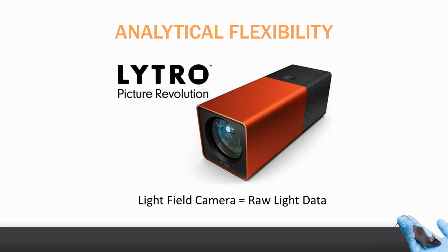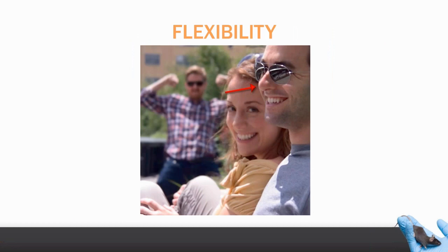So I was looking for a metaphor to describe this huge amount of information that you get from the system, which gives you a lot of versatility. And I came across the light field camera, which basically you point at a scene and it captures all of the raw light data, and then afterwards you can change the focus of the picture as you wish. To continue the metaphor, let's say you've just finished a study, you are about to submit it, and someone comes up with a new analytical technique which is an improvement on the one you were using. And so you would like to use that new technique.